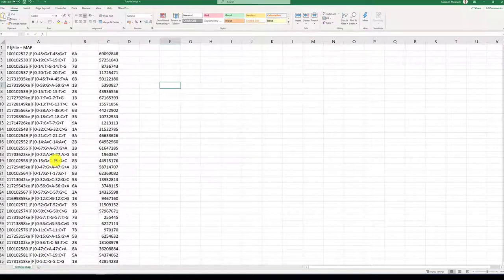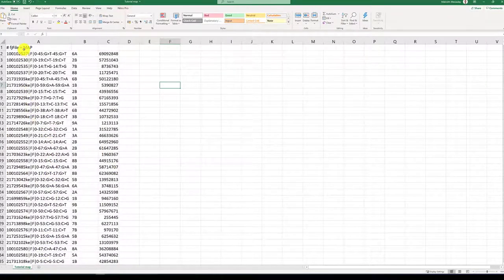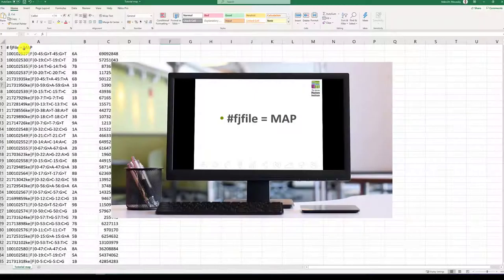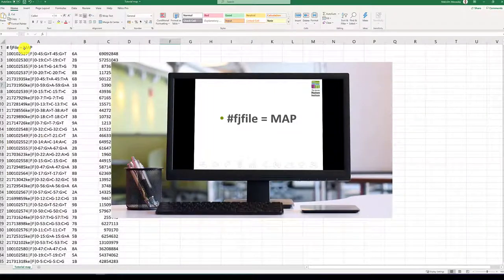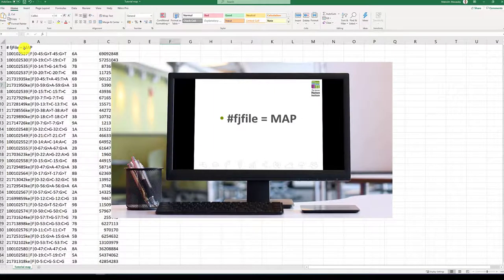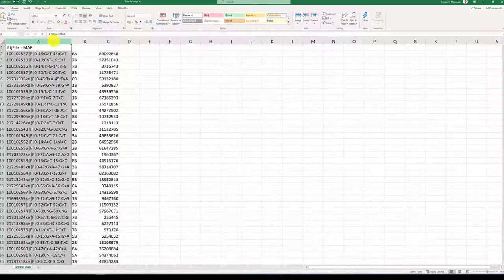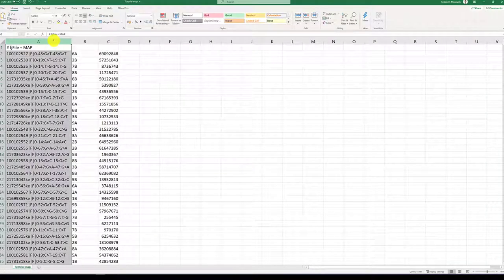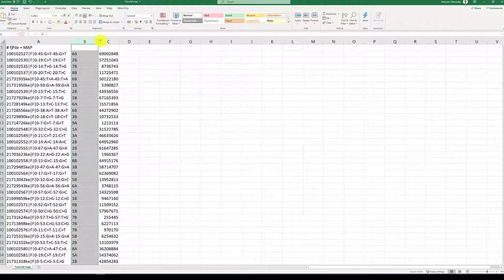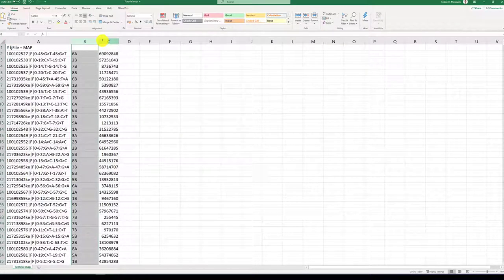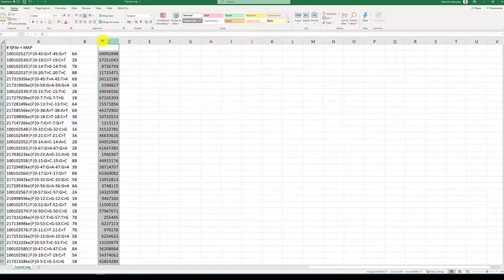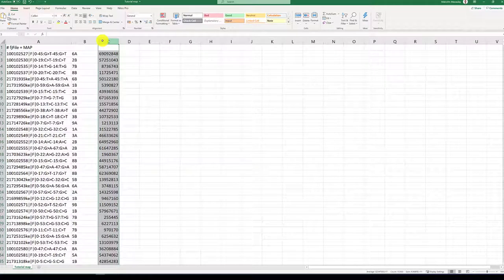A map file should contain a header line, hashtag fjfile equals map. It should contain a column with your marker name, a column with your chromosome designation, and a column with physical or genetic marker location.